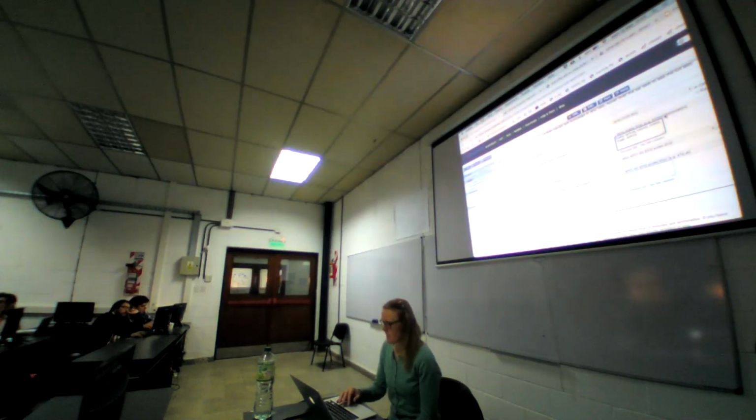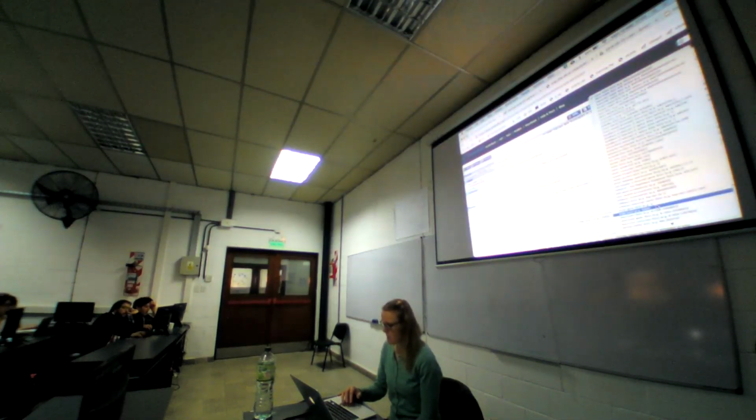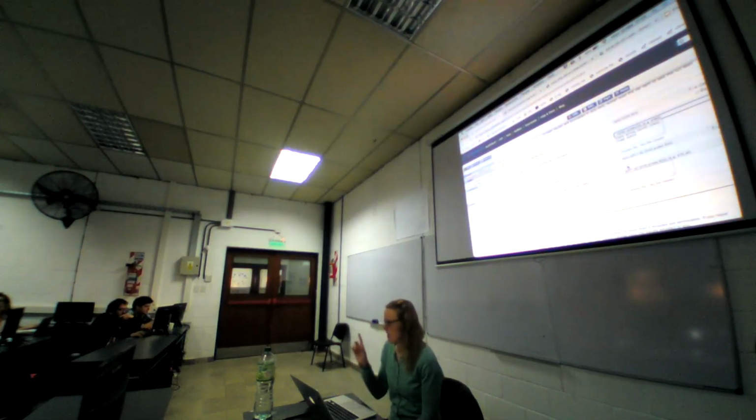So you need to select from the drop-down menu the correct option. And you can see there are lots of different IDs we support. I know that these are HGNC symbols. This is the major source of our gene names. So I select that, but they all come with examples in brackets.